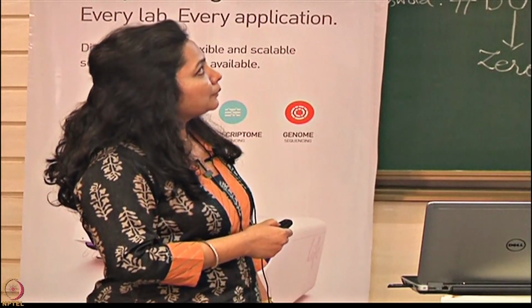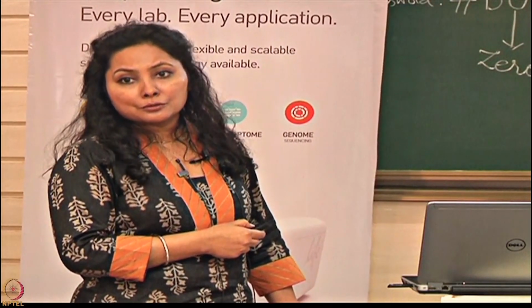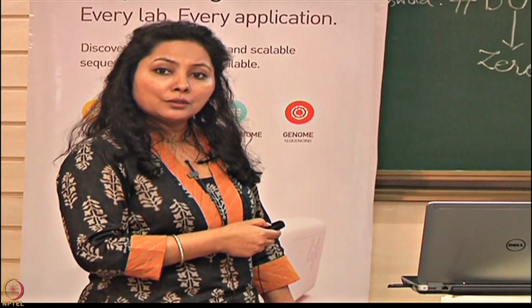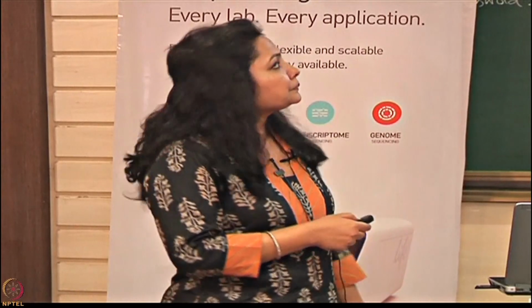Then comes the template preparation. As we discussed, during template preparation you are loading these library molecules onto the ion spheres, and then finally these ion spheres are loaded onto the chip. Now these loaded chips you take from here and load onto this system, and they are good to go for sequencing.